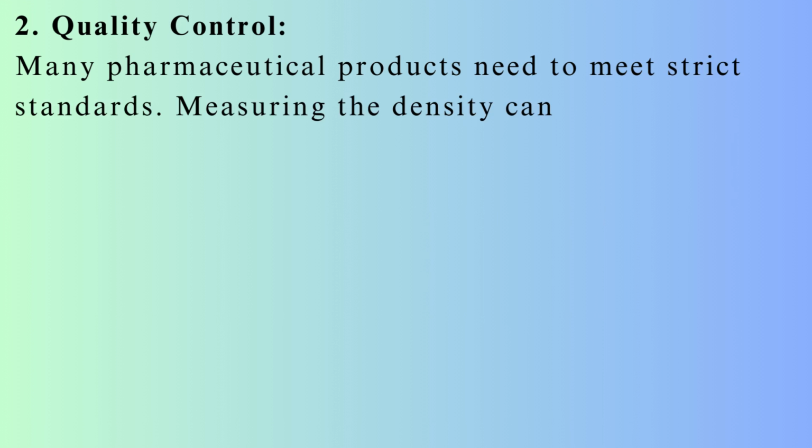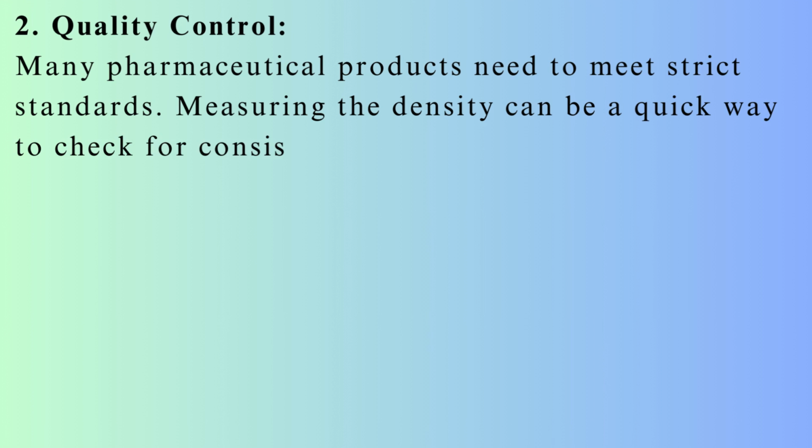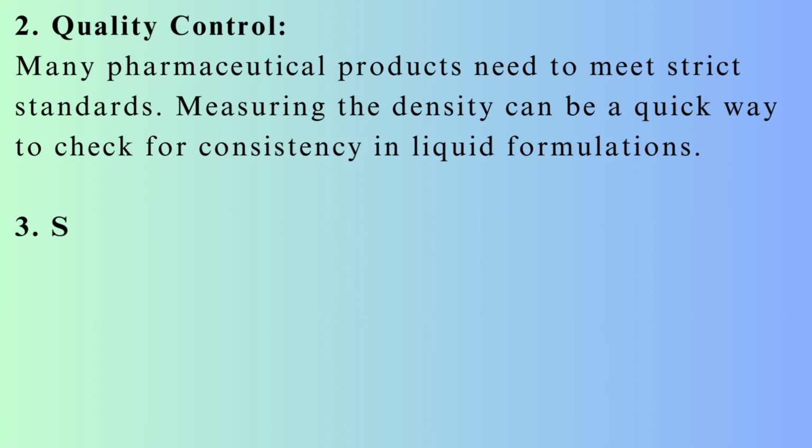Quality control. Many pharmaceutical products need to meet strict standards. Measuring the density can be a quick way to check for consistency in liquid formulations.